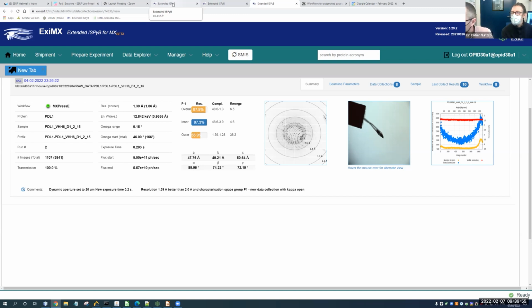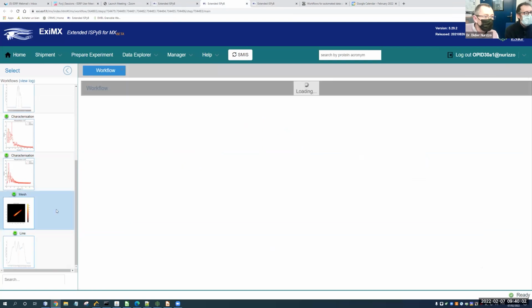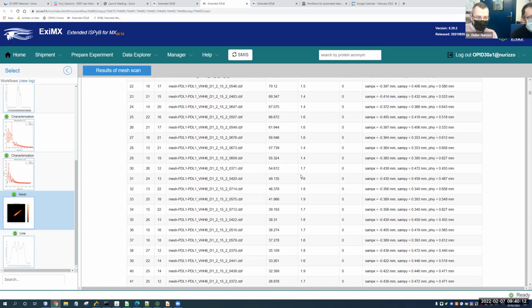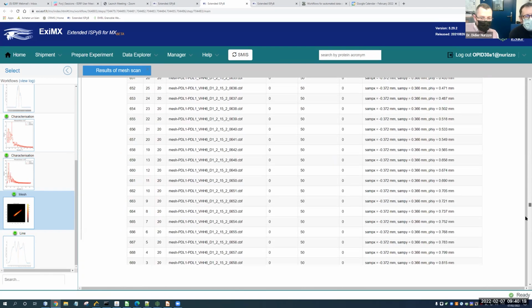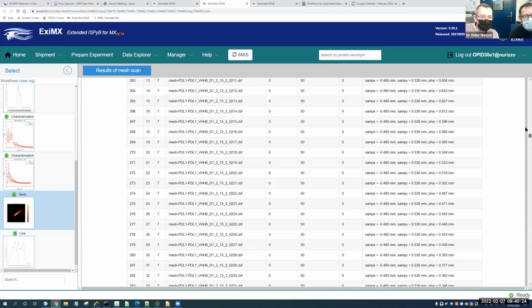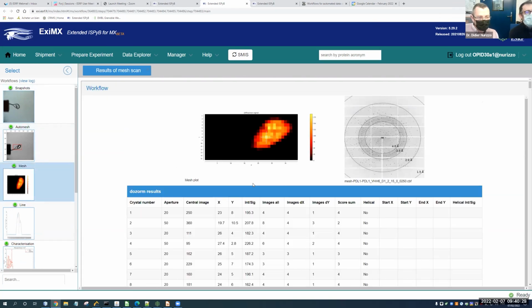Could you please explain again how you interpret the heat map results? Okay, we can come back to that. That's not difficult. In fact, we've got 2 heat maps. The first one is the rough heat map from Dozor, and not Dozor M. We don't have it here, you have to go for the other one. This one, yes. Okay, right.